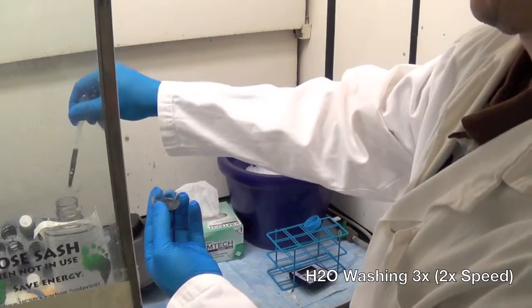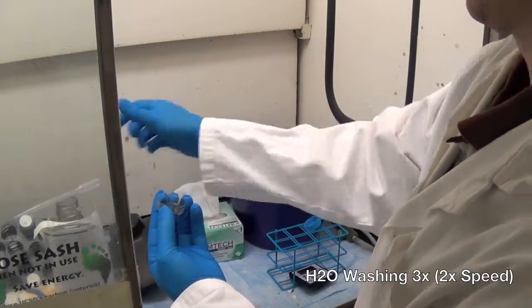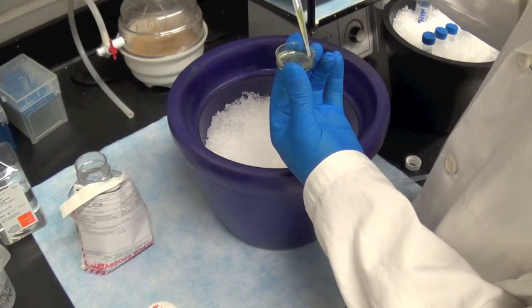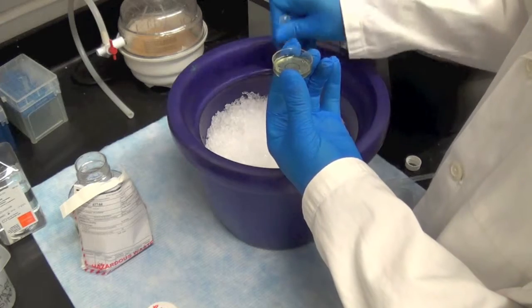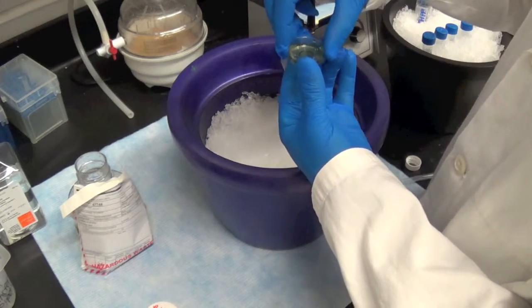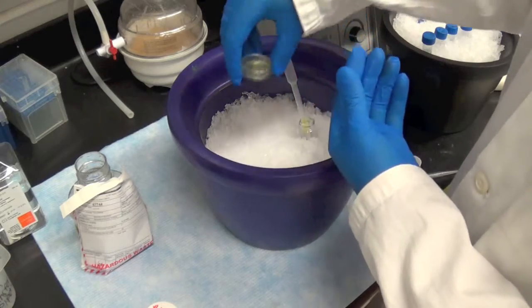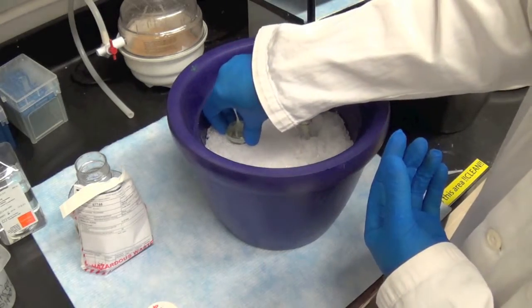After the 30-minute osmium fixation time has elapsed, remove the osmium and wash 3 times with water. Replace the water with your filtered uranyl acetate solution. UA staining takes at least 1 hour, but can be taken overnight, as long as the sample stays at 4 degrees Celsius.